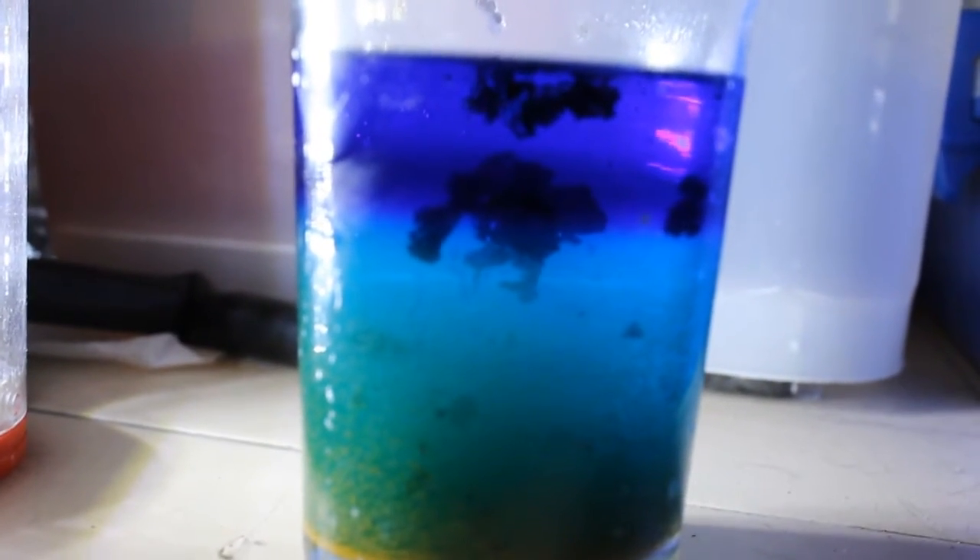This is much later now, after the electrolysis is done. There's a bottom layer of acidic copper sulfate and a top layer of Schweizer's reagent.